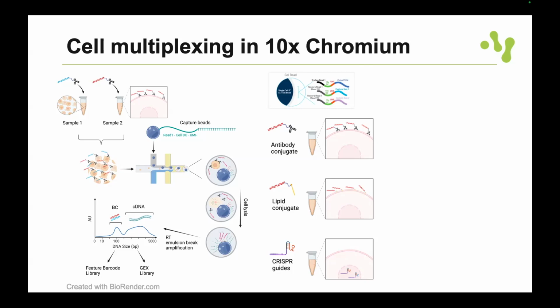Nowadays, with the new version, they say you capture up to 20,000 cells per reaction. But at that rate, I think you have a 10% doublet rate or something like that. You will learn some tools here, but those are sequencing reads not useful, and you need to take that into account.